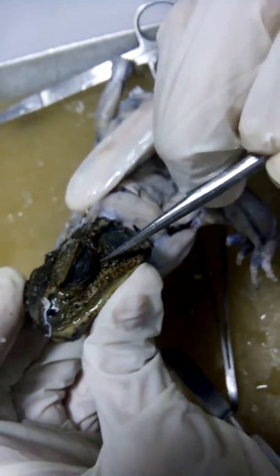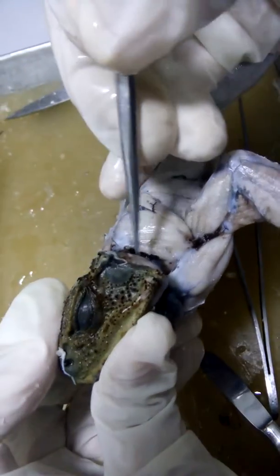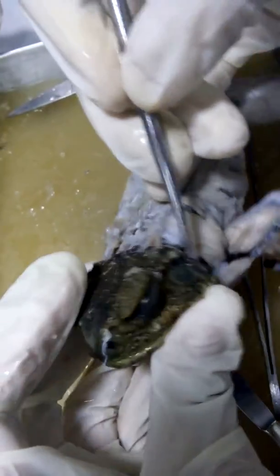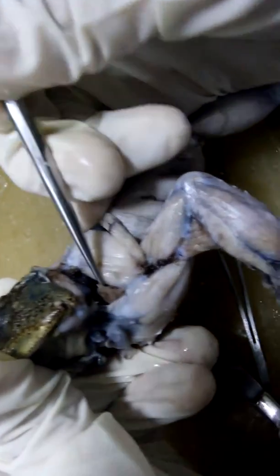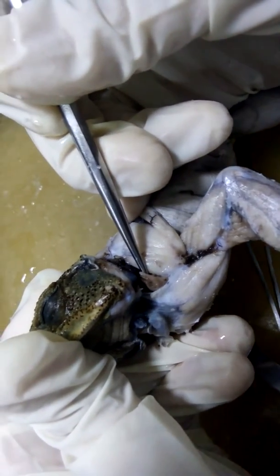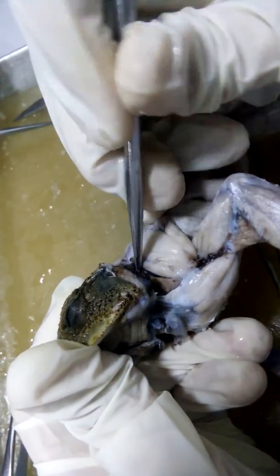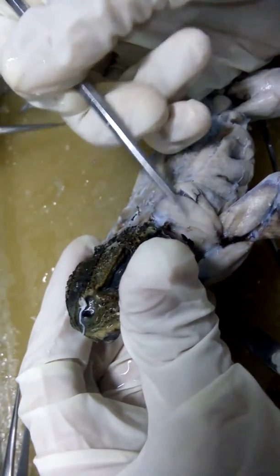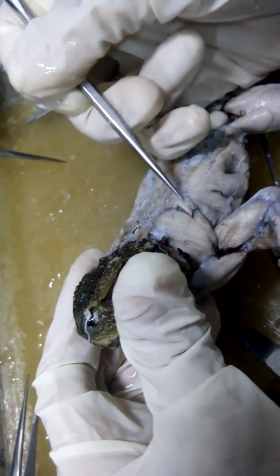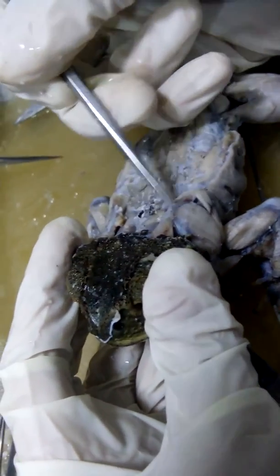So again, this here is your temporalis, and then internal to your temporalis is your masseter. This right here is your depressor mandibulae, and below it, this is your levator scapulae inferior, and internal to that is your superior. Again, posterior to it is your dorsalis scapulae. This one is your latissimus dorsi, continuous to your trapezius.